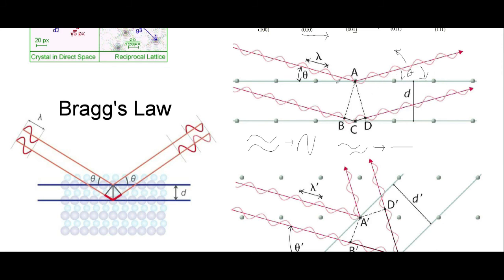And so given these planes, if this is a screen, that's a really bad looking screen. If we have a screen like this that's catching the different outgoing beams, then you're going to have a part up here where the beams are constructively interfering, but as you go down, there's destructive interference, then constructive, and then it's going to keep going like this through the different angles.